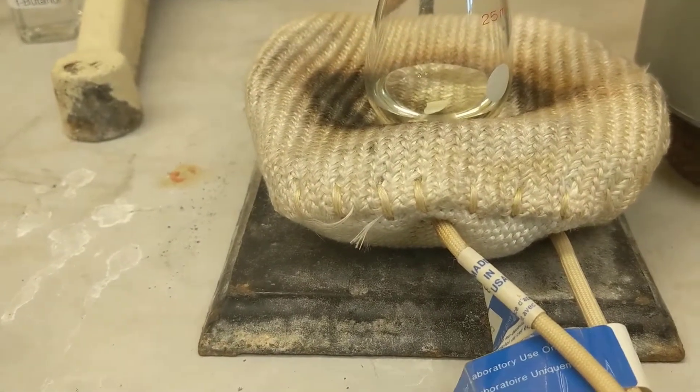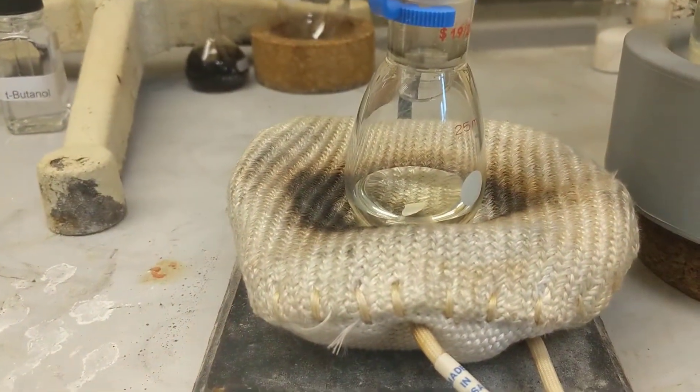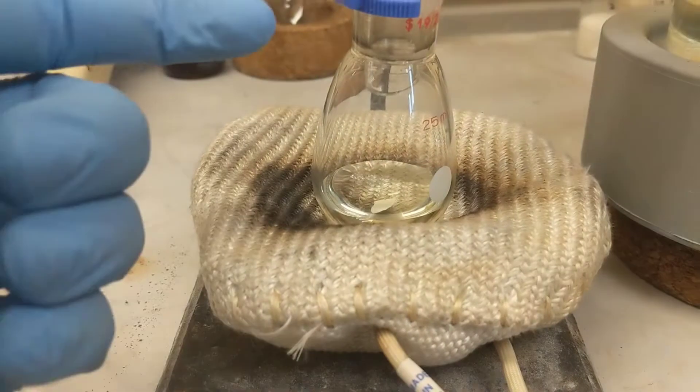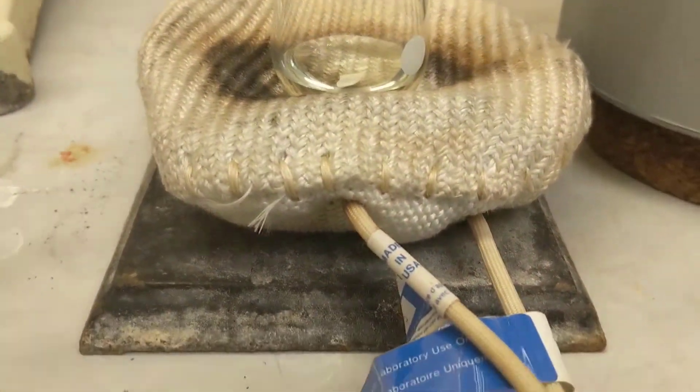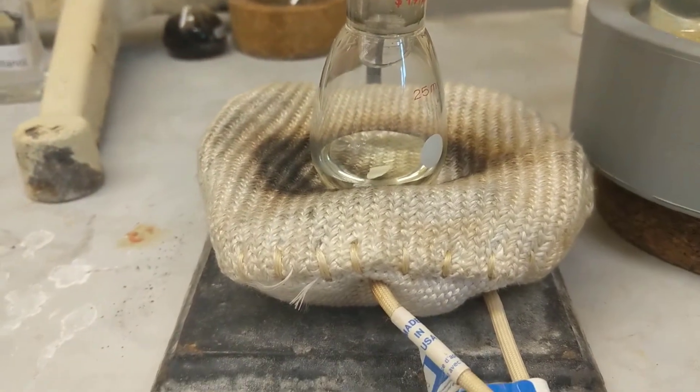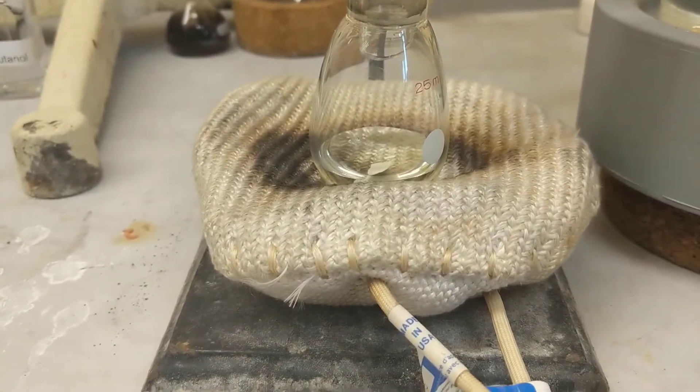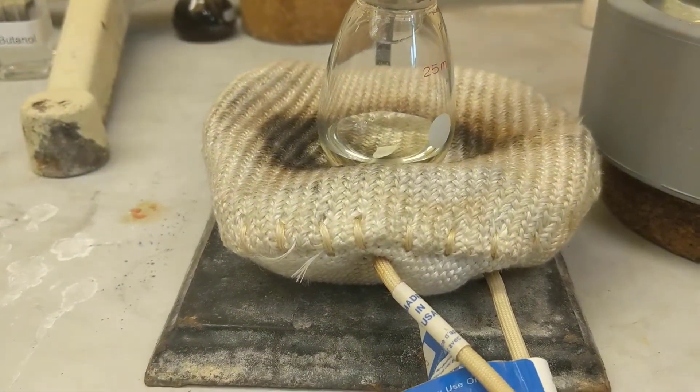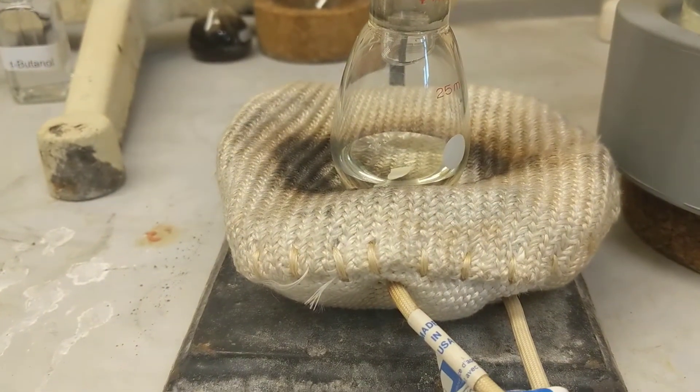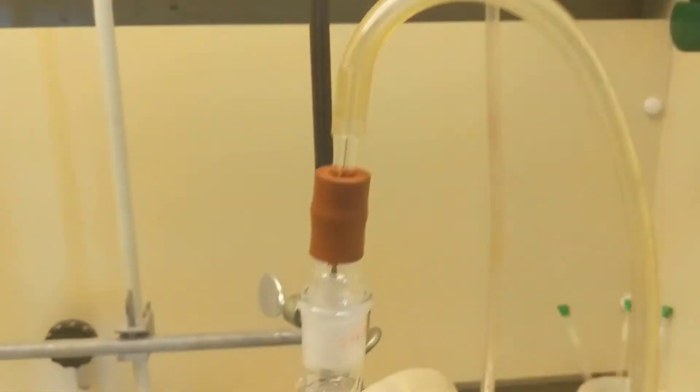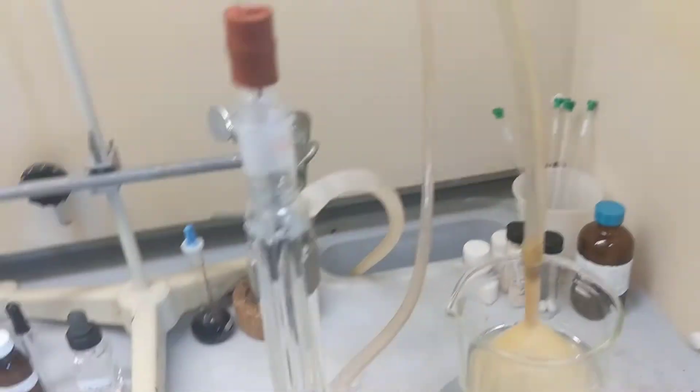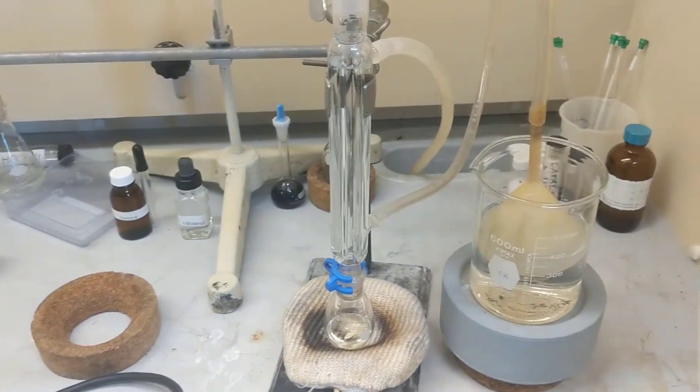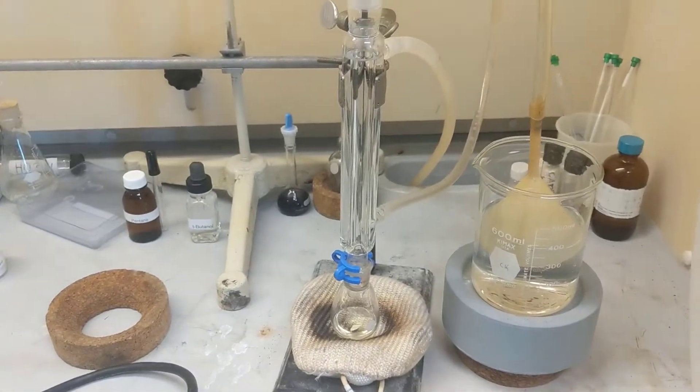I'm just going to heat this until I get it at a gentle boil. More important than that though, I want one drop of liquid condensing back down per second. When I get that, I start my timer and I do that for an hour. Make sure your apparatus is nice and tight. You don't want any halides leaking out. I'll get back to you when I get the rate I want.